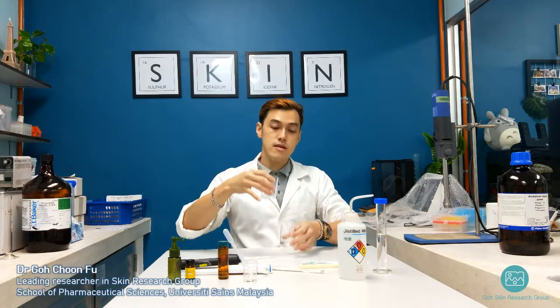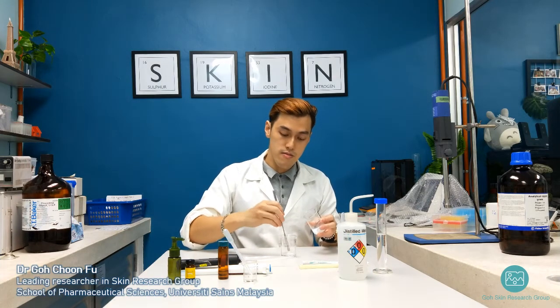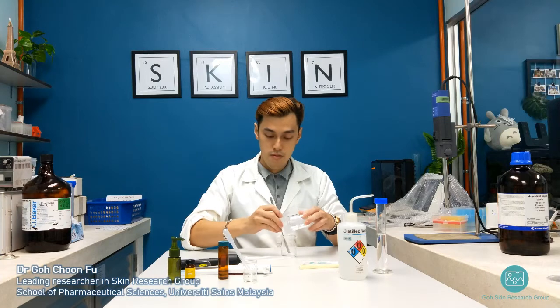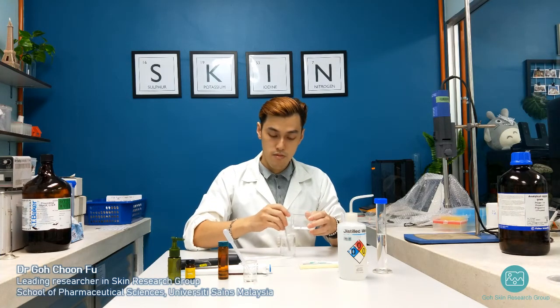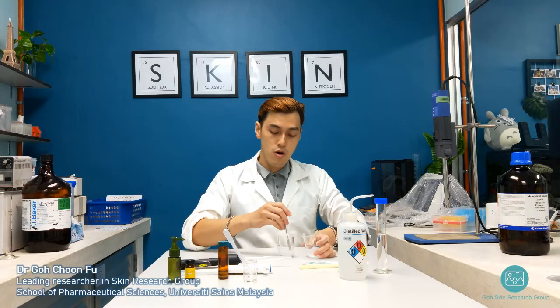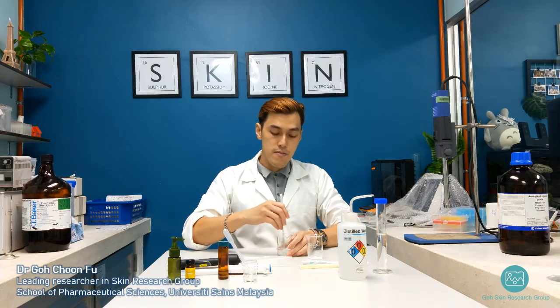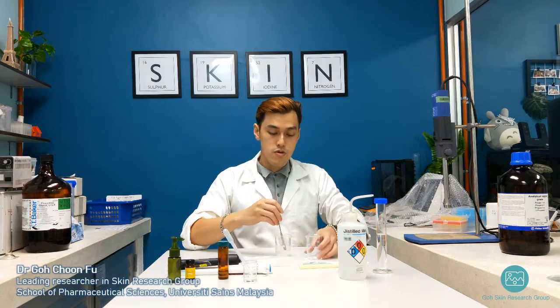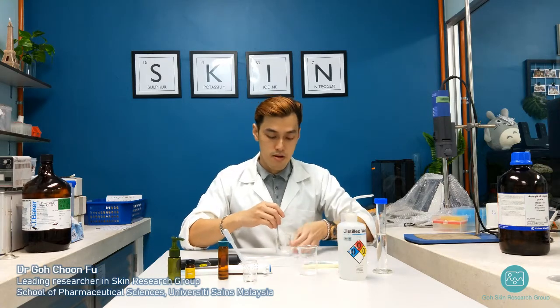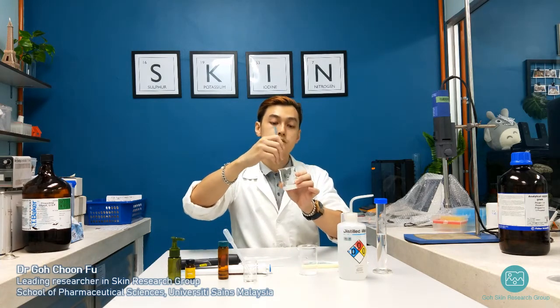Now we can start to sprinkle a little bit of the polymer, this Hypromellose, into the liquid while we do the stirring. Sprinkle little by little to avoid it clumping. If you have a mixer at home or in your lab, it will be wise to use it. Later on we are going to use a homogenizer to help mix up the gelling agent so that it can form a nice gel. As you can see, the liquid starts to thicken.